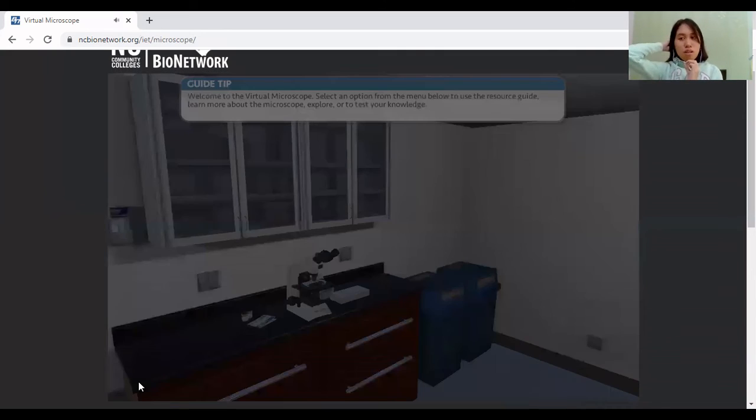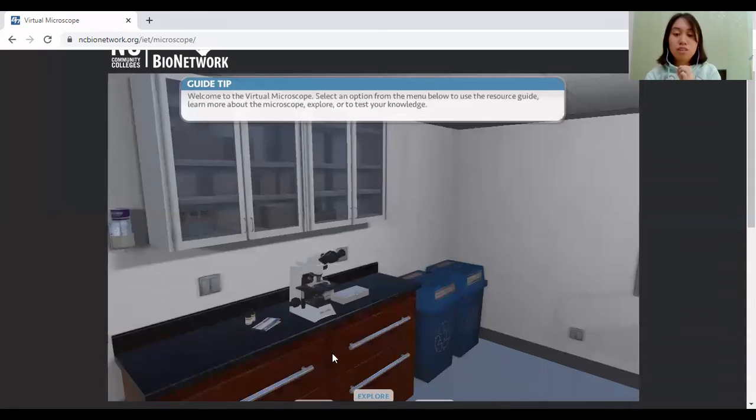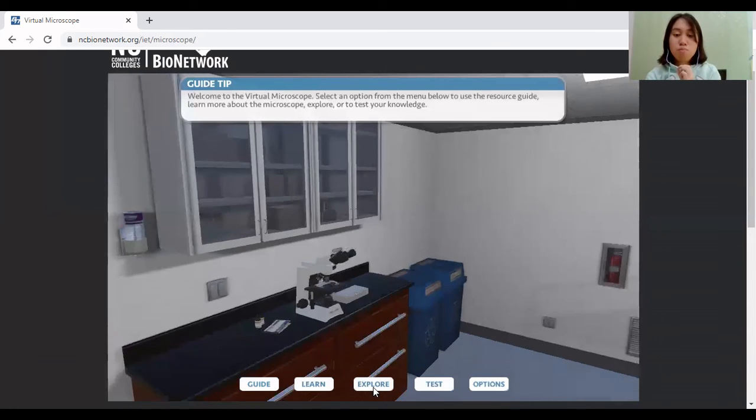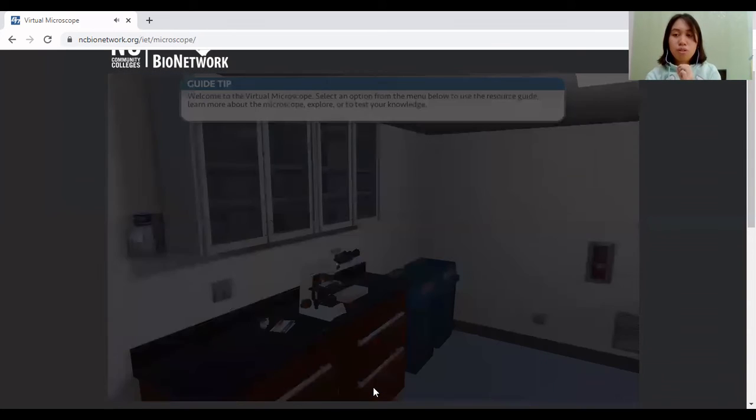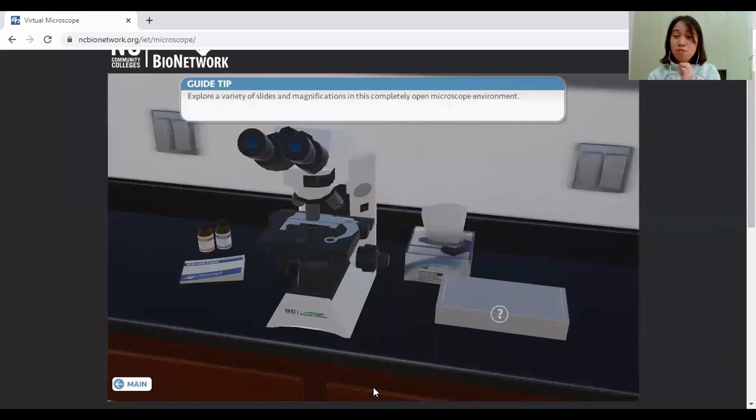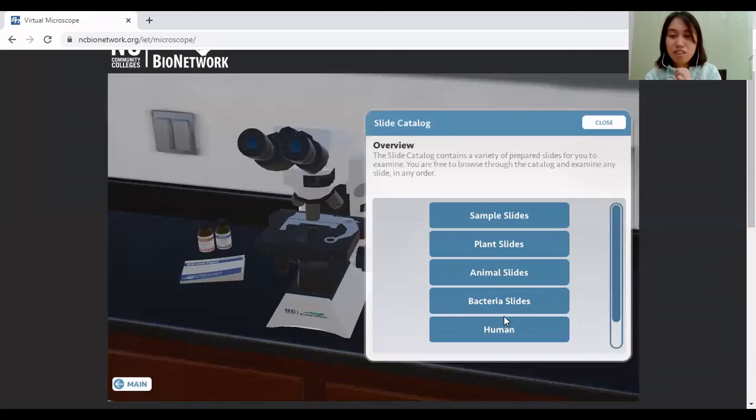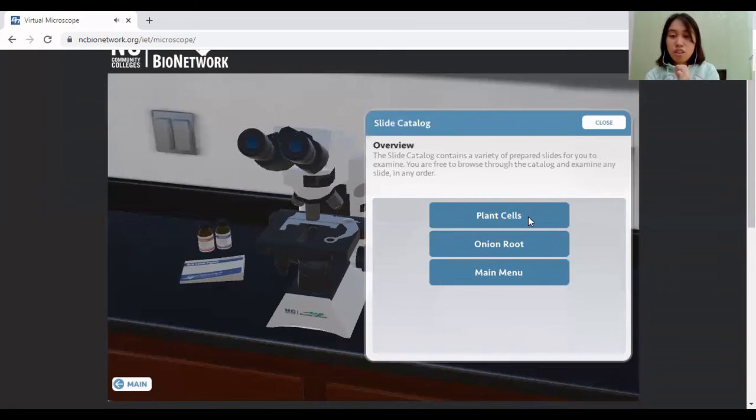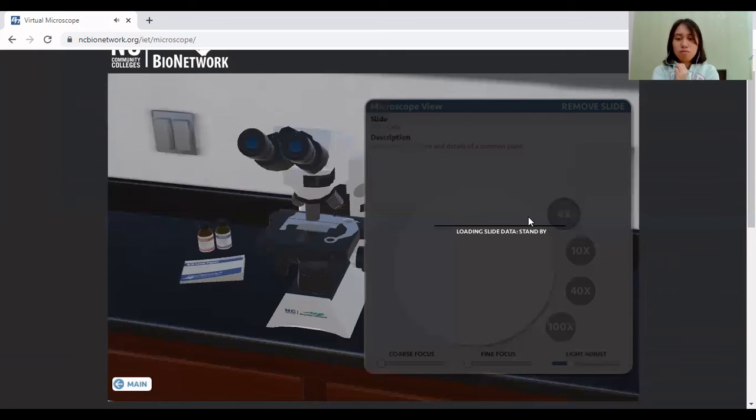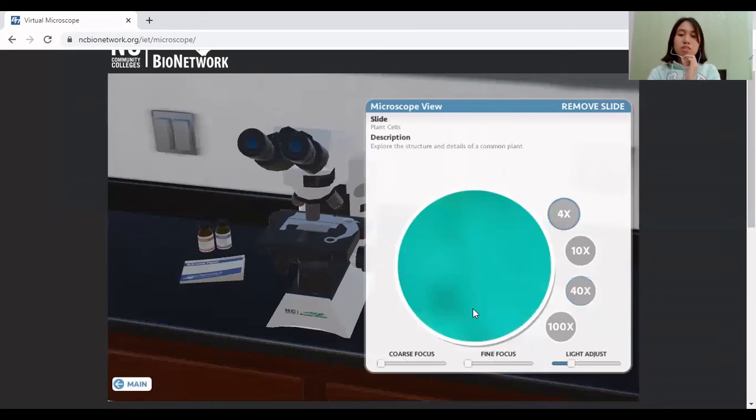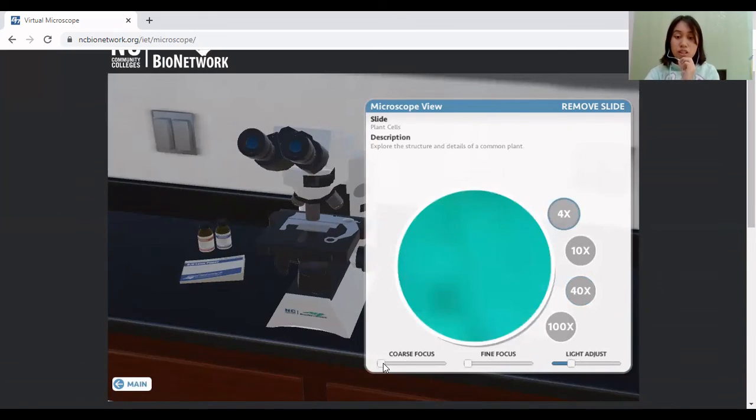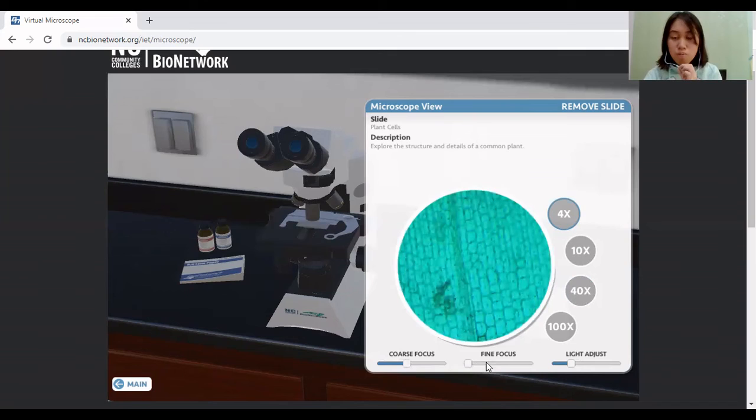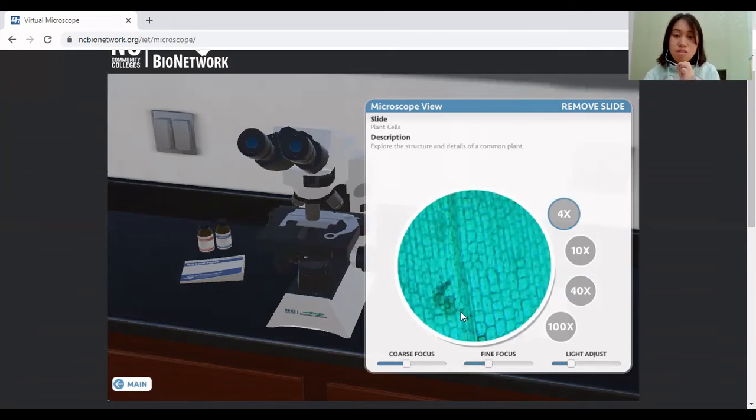Next, I'm going to do another slide to explore a more specific view of the samples. So I'm going to start here. I'm just going to try the plant cells. There you go. So the picture is blurred, so you're going to adjust it. There you go. And then the fine focus for more sharpness, then you can see the closer view of the plant cell.